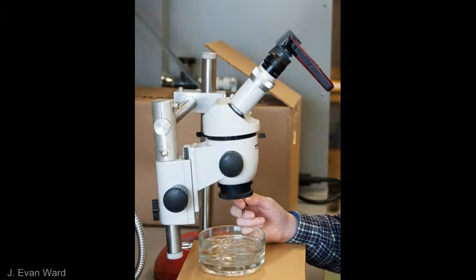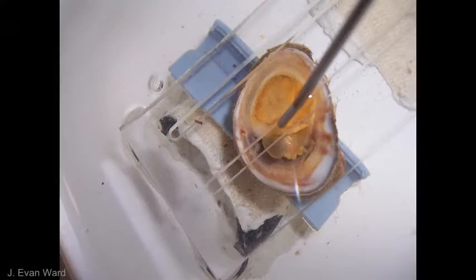Microscopic observations were made of the ventral surface of snails attached to glass plates, which were inverted in flowing seawater — so remember that you are viewing the snails upside down. Endoscopic observations were made with a similar setup, except snails were allowed to attach to slotted plastic plates that enabled the optical insertion tube of the endoscope to be inserted into the mantle cavity of the snail.